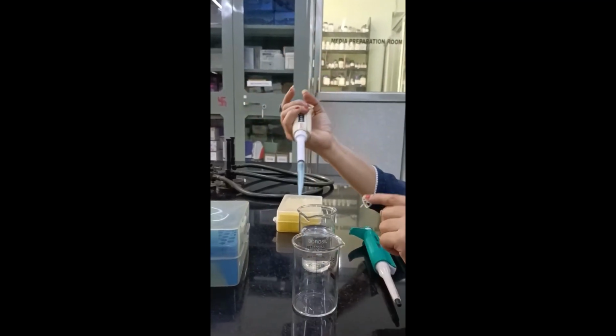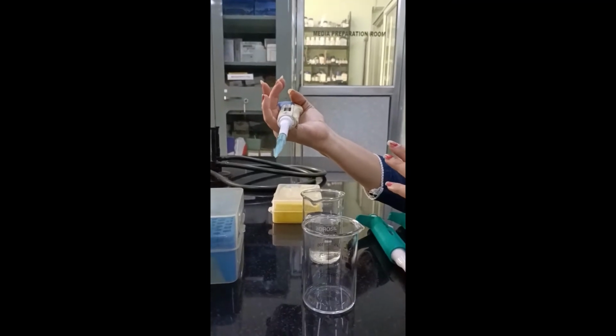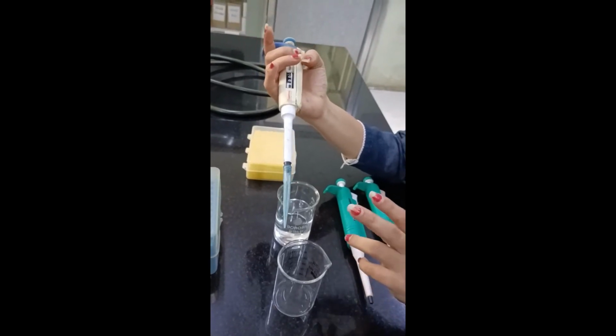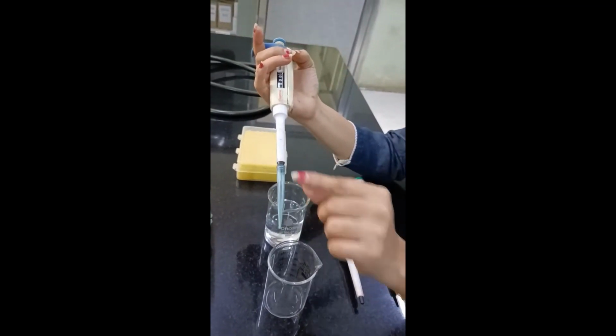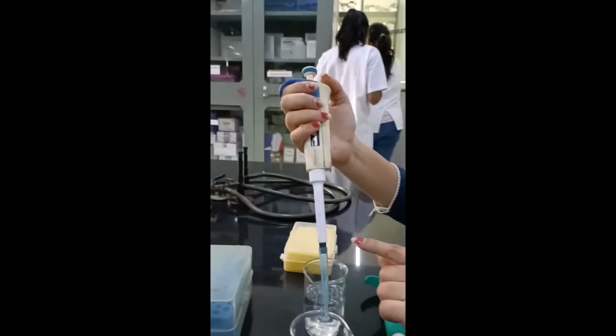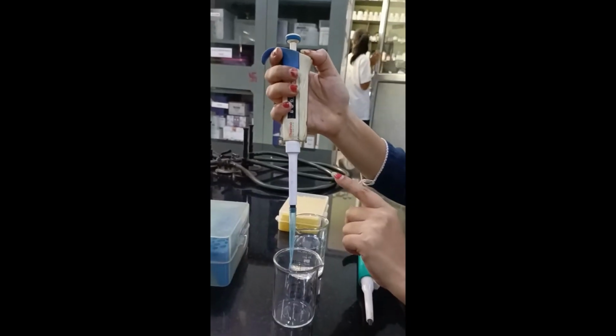This is how exactly the working or handling of the micropipette is done. As you are done with it, you need to discard the micro tip. For discarding, you don't have to hold it over here to remove the micro tip. You can discard it by just pressing this particular knob which is present over here.